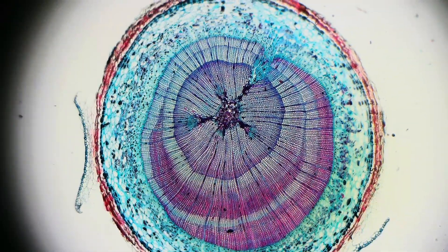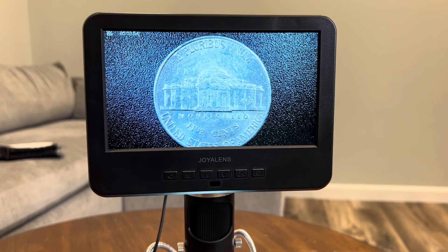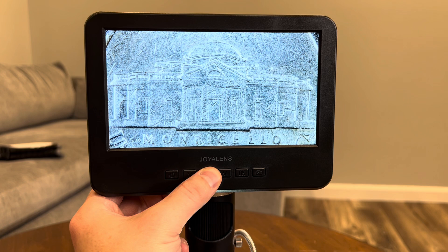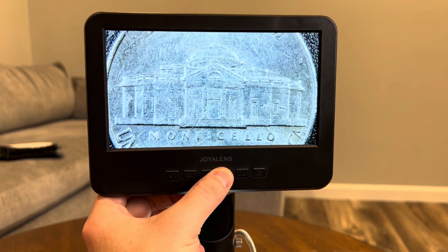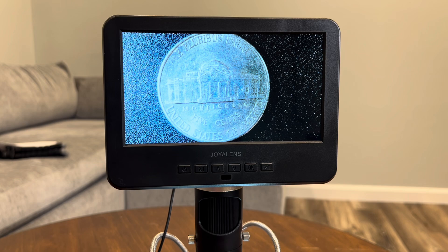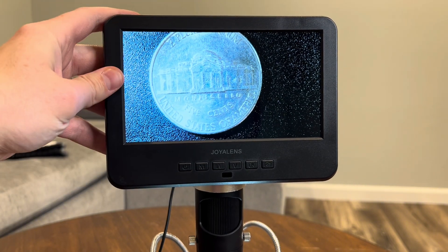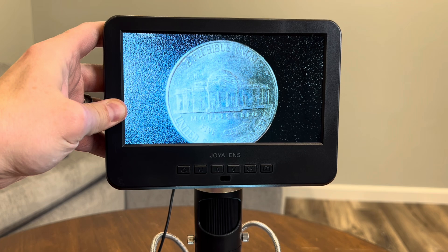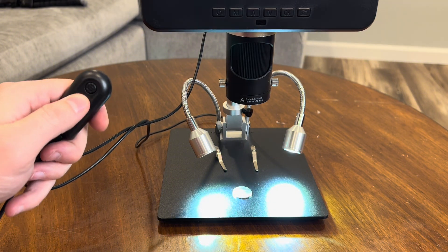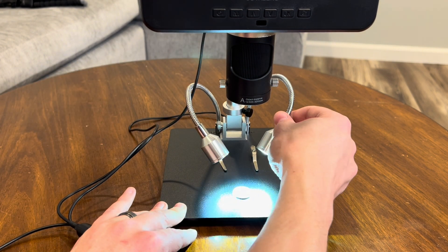Now let's wrap up with a quick breakdown of the pros and cons. The first pro is the high magnification range — this microscope gives you incredible flexibility to view objects with great clarity at both low and high magnifications, whether you're working with biological samples, electronics, or small objects like coins. The next pro is the 7-inch HD display. It's large, bright, and offers a clear view of what you're examining without needing external screens, which is especially helpful for long periods of use as it reduces eye strain. Another pro is the adjustable LED lighting — it gives you full control over brightness, making sure you always have the right amount of light, even in dim environments or when examining reflective objects.